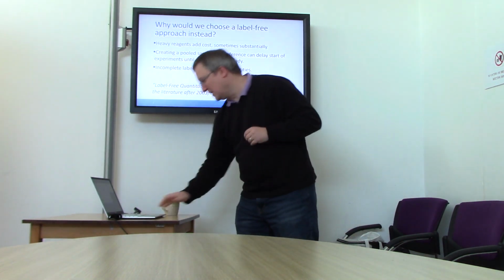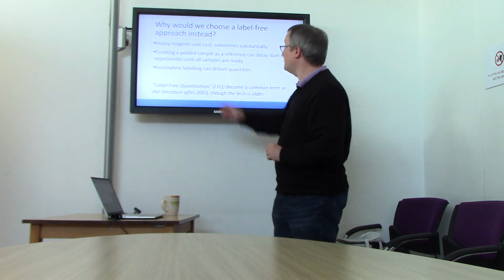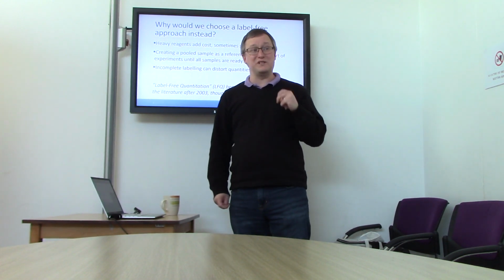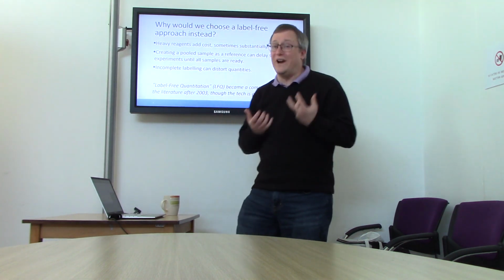Okay. So why would we do away with this? Why would we push that to the side and say, this is not the way we're going to do things? Well, first off, heavy reagents cost money. And I think everyone knows that research budgets are always straining to cover personnel and equipment and services and so on, and reagents can add quite a lot.